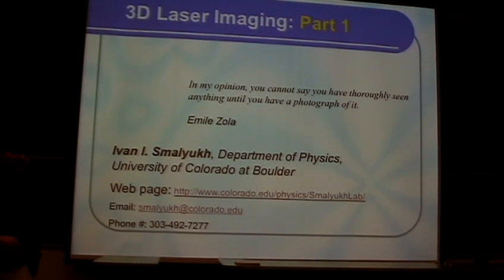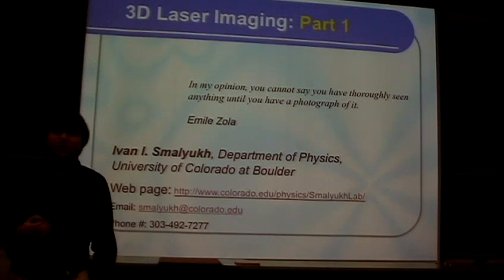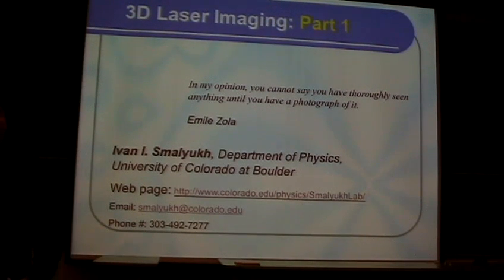This very well describes what we want to do with different types of imaging, such as confocal microscopy, multi-photon microscopy, and other nonlinear microscopy techniques. What we really want is to see the sample better and resolve all tiny features in the sample.